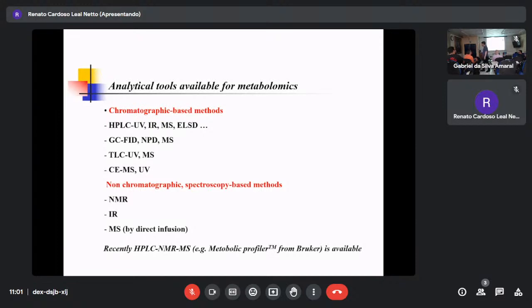So what's the NIR? Do you know NIR? What's the target? In NMR, it's a radio frequency, very long wavelength, like 1 or 5 meters, if you turn on the radio, then the proton, nucleus, they are observed. So this is different. But in NIR, when they add NIR, this one is like a microwave.